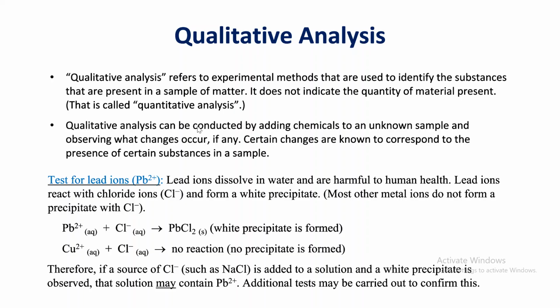This also can refer to the analysis that can be conducted by adding chemicals to an unknown sample and observing what changes occur, if any. Certain changes are known to correspond to the presence of certain substances in a sample.